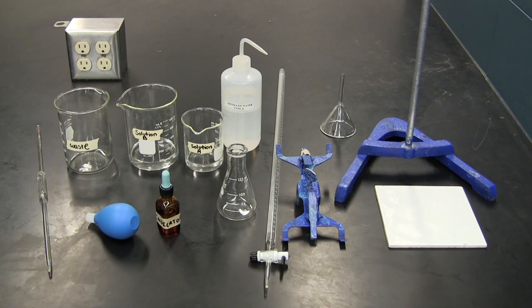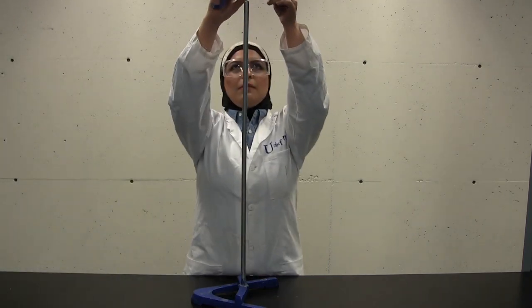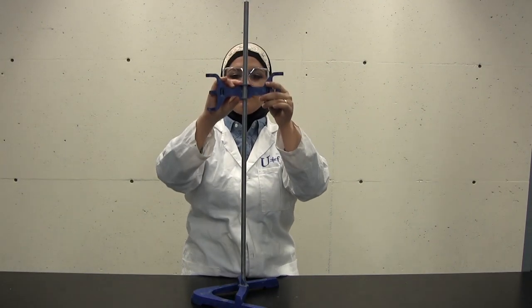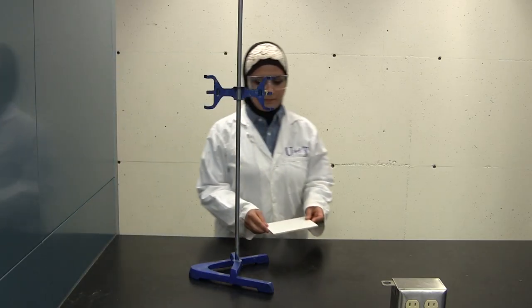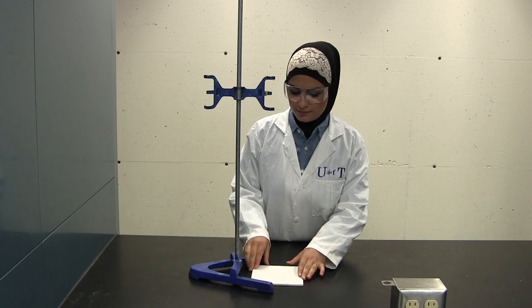First, start off with a clean workbench and place a retort stand on top of it. Obtain a burette clamp and attach it about half the height of the retort stand. Place a white tile on top of the working bench just in front of the retort stand. This can be found in the drawer under your fume hood.